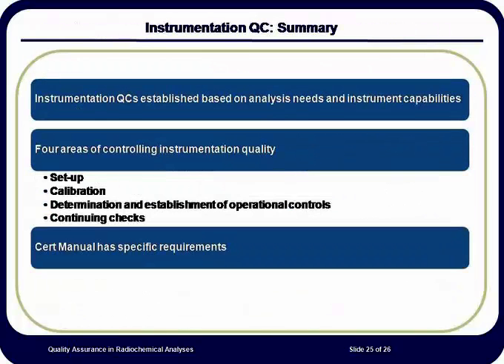Each instrument should be set up in accordance with the manufacturer's specifications. The efficiency and background for each detector should be verified with the specification provided with the instrument. Once the instrument is set up and a qualitative check of its performance has been done, a calibration must be performed using NIST traceable sources. Following the calibration, quality control checks of the instrument should begin and a control chart for each parameter established.